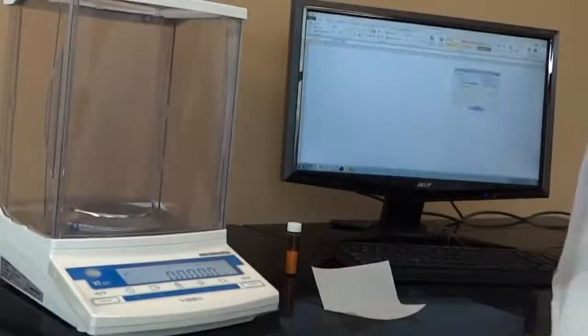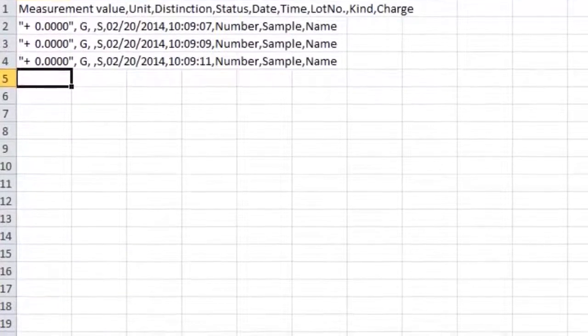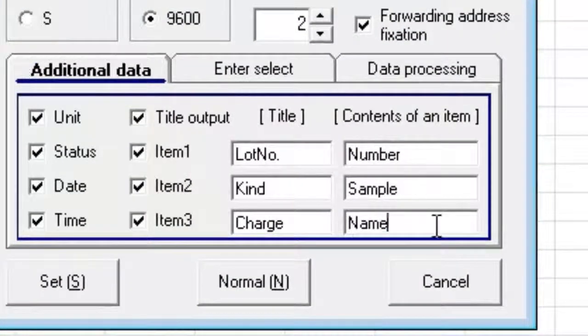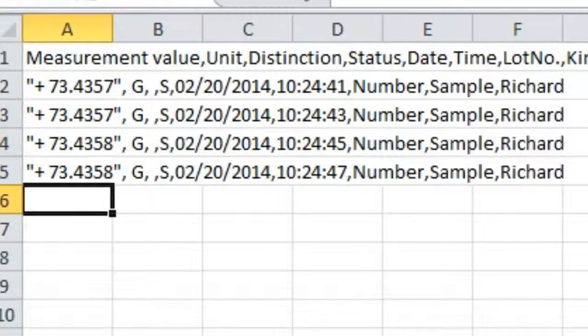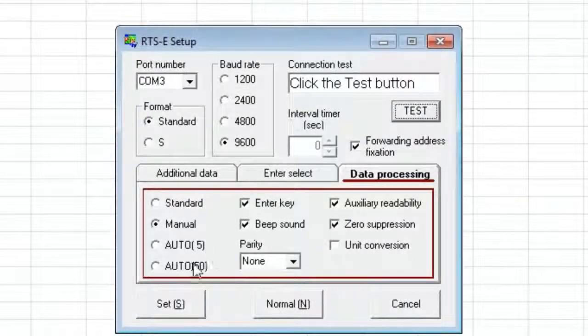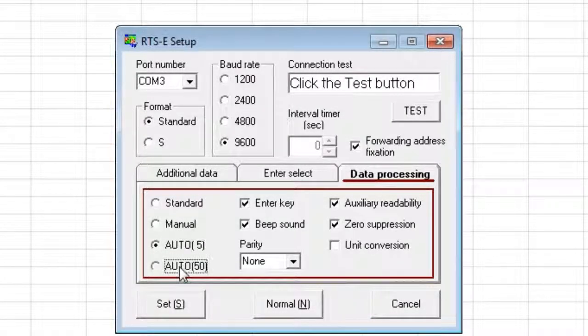All Vibra units come with downloadable wedge software. When the balance is connected to the computer via serial RS-232 or USB, the data will be transferred to the text entry software of your choice — it functions as if typing the weighing data directly through your keyboard. The output can be customized with many labels. Weighing data can be recorded at set intervals, manually, or set to automatically record when the balance reaches stability past a threshold of 5 grams or 50 grams.